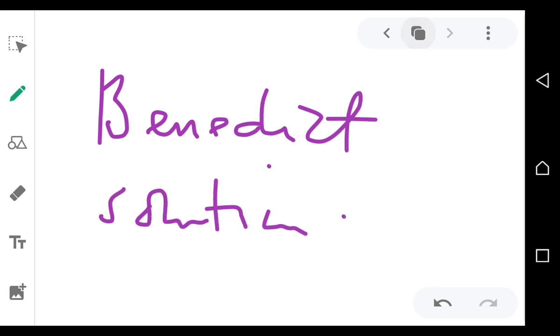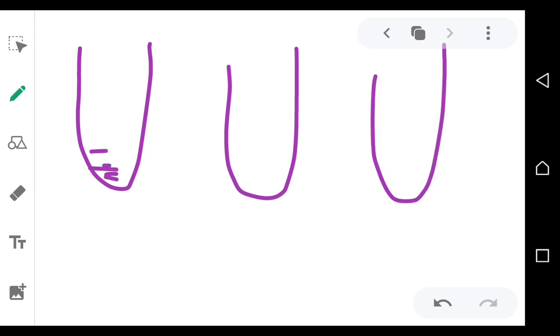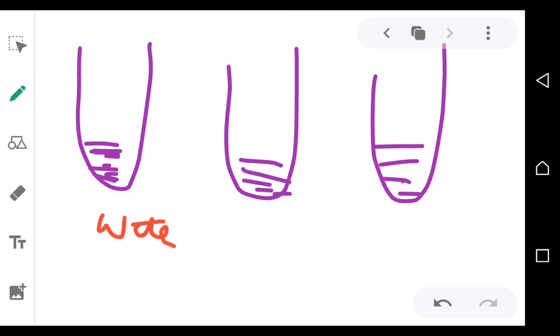So when you enter the lab in the exam, they're practical. You enter the lab, they may give you 3 test tubes, for example, and then they fill them with different substances. In here they can put water, in here they can put glucose, in here they can put sugar, for example. In the first test tube, they put for you water.